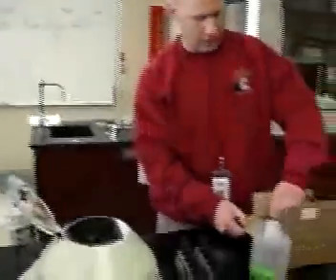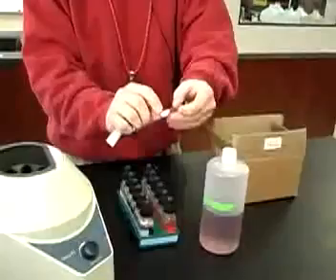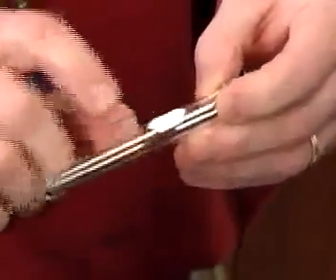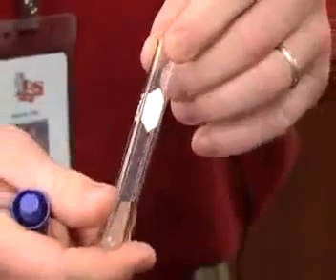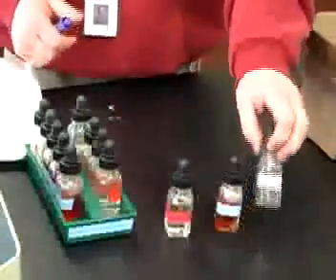These are the test tubes that you'll be using. And you can see that there's a small little white box on there. If you use a pencil, you can write on there and it won't come off in the hot water bath, because sometimes you have to heat it. We'll show you some of the other equipment as we go along as well. These aren't filled yet because we're not going to fill them until right before the lab starts.